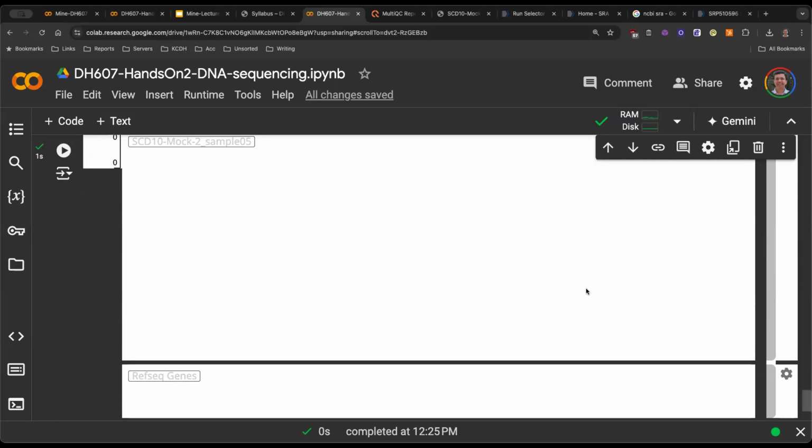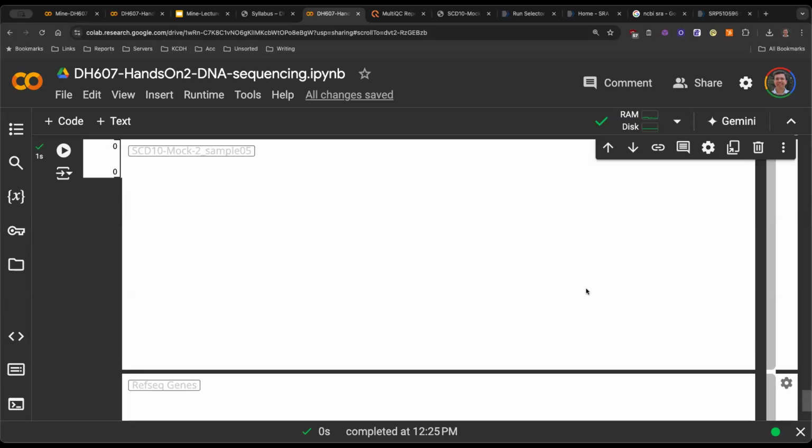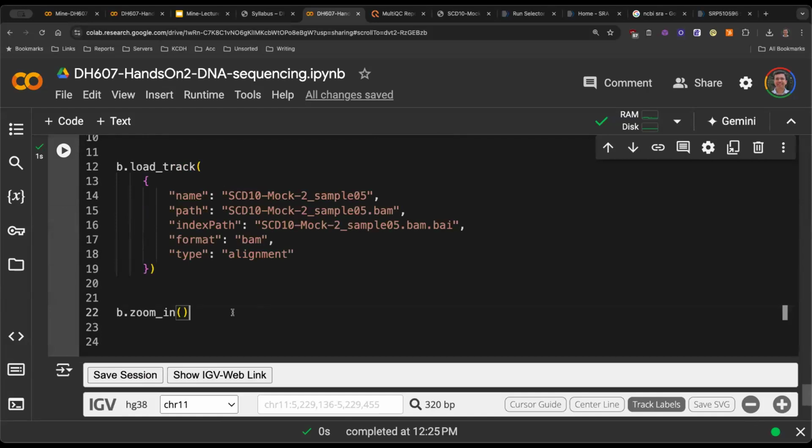So what I've taught you is actually what a lot of companies do. Imagine you are sitting at this company, let's call it F-Trend. You go to it, it will try to do a panel for you and it will try to understand which genome mutations you have. So it will do exactly the steps that we did. Once you get that alignment data, it will visually verify whether you actually have that mutation or not, was it miscalled or so on.